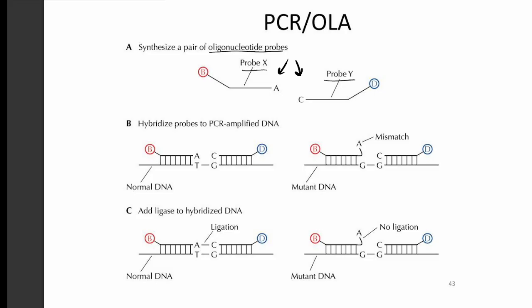Now what happens is that we have to take the normal DNA and then attach this particular thing here. So one probe is attached here and another probe, the adjacent probe, is here. Also this B represents biotin, and this biotin is very essential for the probes to be separated later on. So biotin is an additional component which we are adding here, which helps in detection and separation. So suppose it is a sequence specific probe and here it is the adjacent probe.